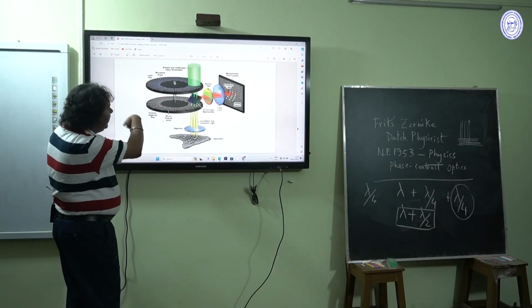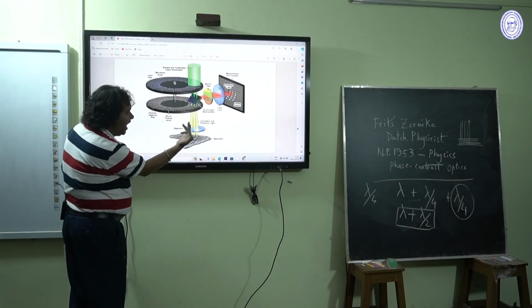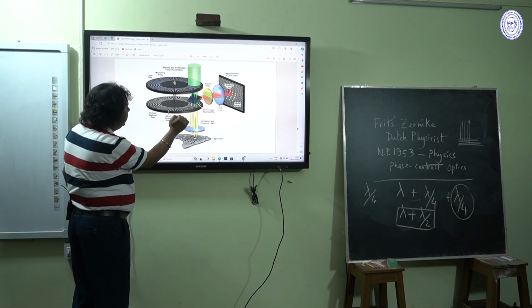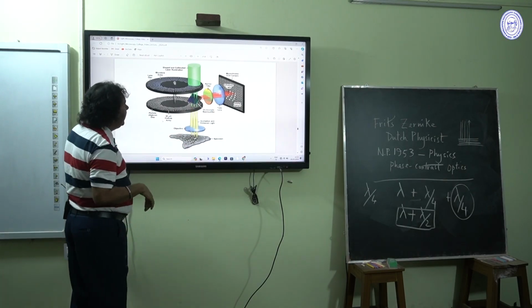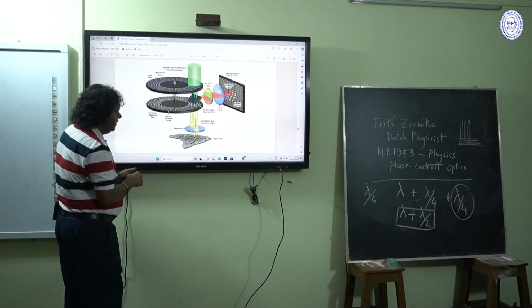And it is spinning, so it can scan thousands of images. By using that pinhole, only the light that has the conjugate focal plane onto the pinhole will pass.